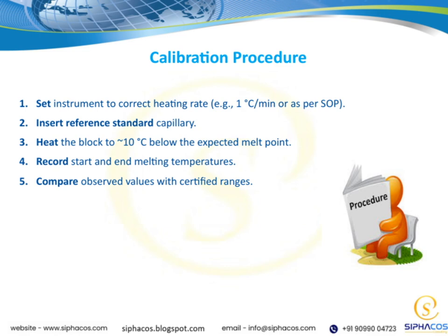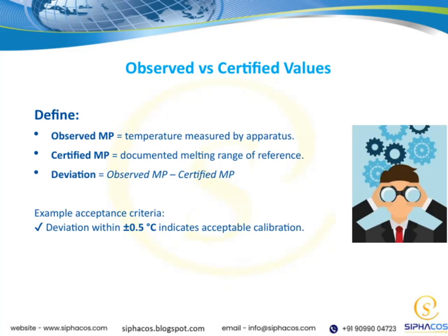Remember, proper calibration is essential for maintaining the precision and consistency of your measurements throughout your analysis. All right, let's take a look at Slide 8, which focuses on observed versus certified values.